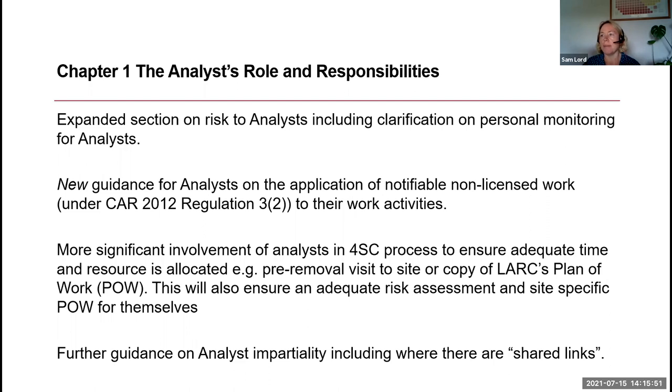Chapter one is about the analyst role and responsibilities. Again, it's really clarifying a lot. There have been some improvements or acknowledgement about analysts themselves and their own health and safety. So there's now material about personal monitoring for analysts. They don't have to have it, but it's recommended that they do. Certainly people that are going in and out of four stage clearance enclosures should be low risk anyway, but their companies may have a personal monitoring strategy for the analysts themselves.